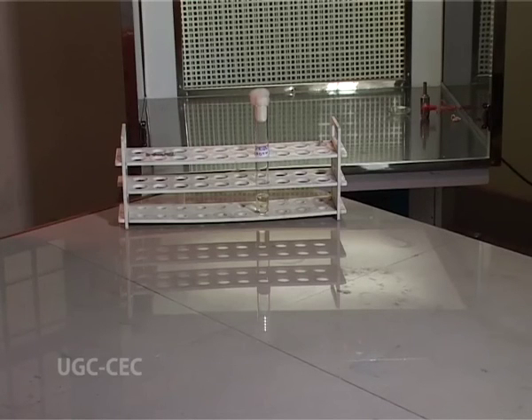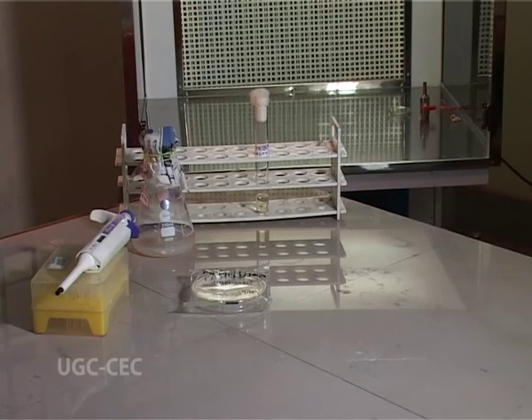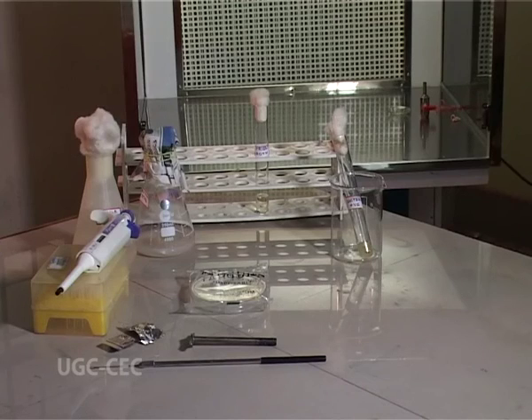We have to have the nutrient broth, nutrient stab, sterile petri dishes, micropipette, cork borer, autoclave, laminar hood, sterile water, as well as gram positive and gram negative bacteria. We have to have antibiotic capsules like ampicillin, streptomycin, penicillin, then inoculation loop, spreader, and spirit lamps.